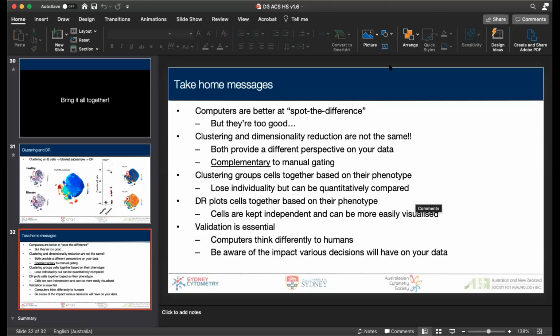I think the idea is that it's informative when that happens, and it maybe encourages us to reevaluate how we're grouping cells together. When you don't get that kind of cluster fragmentation, it indicates that you're identifying subsets that are consistent internally in terms of the data structure, and that's probably quite a good thing. So with blood, that would probably be quite easy most of the time. With a tissue digest with weird infiltrating cells, that's probably when you'd get more of that kind of effect. Hopefully that was the actual question that you asked, and we didn't just misinterpret it.